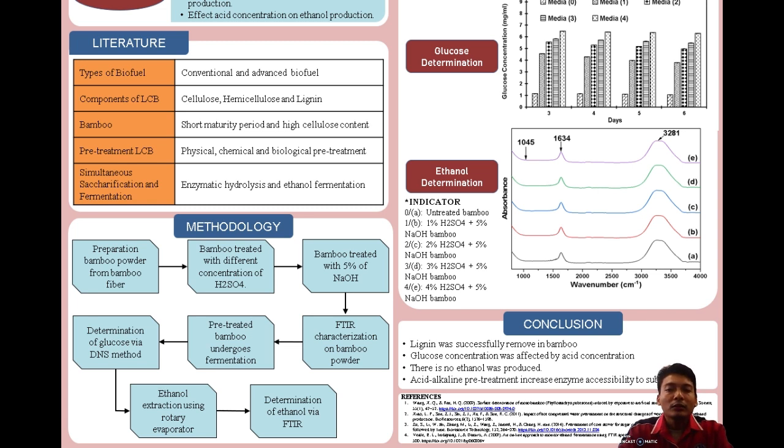Next, the media solution was processed in the rotary evaporator to extract the bioethanol produced during the SSF. The concentration and the availability of bioethanol in the sample were determined by using FTIR. The methodology for this study covers all three objectives stated in Chapter 1.